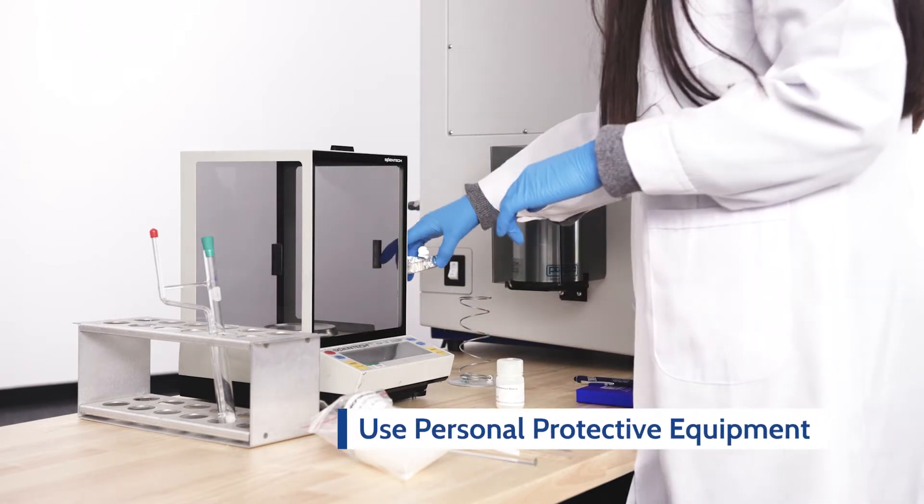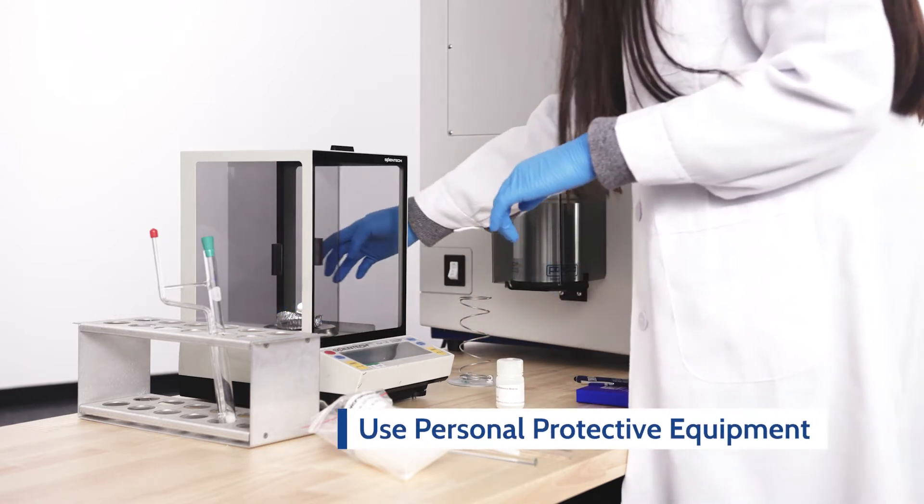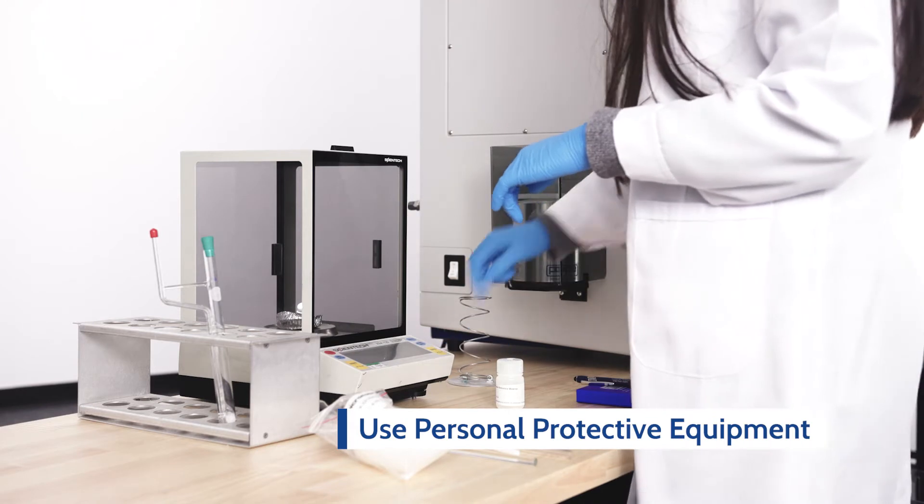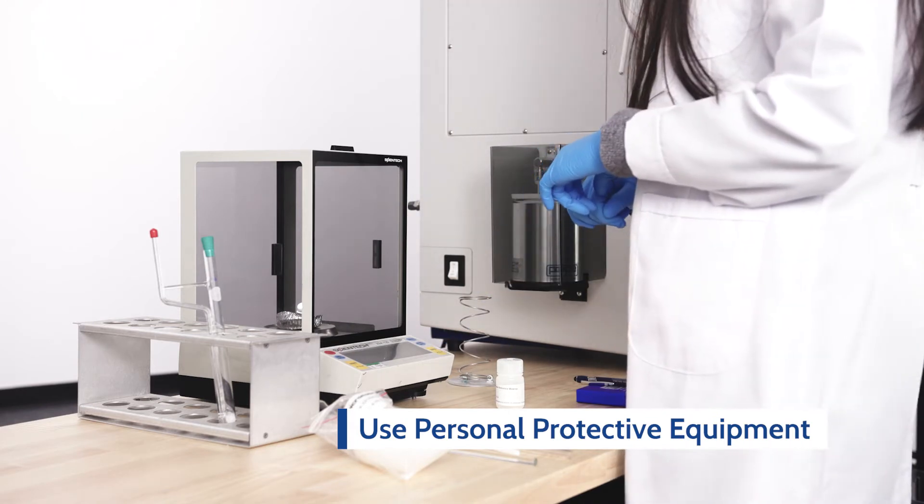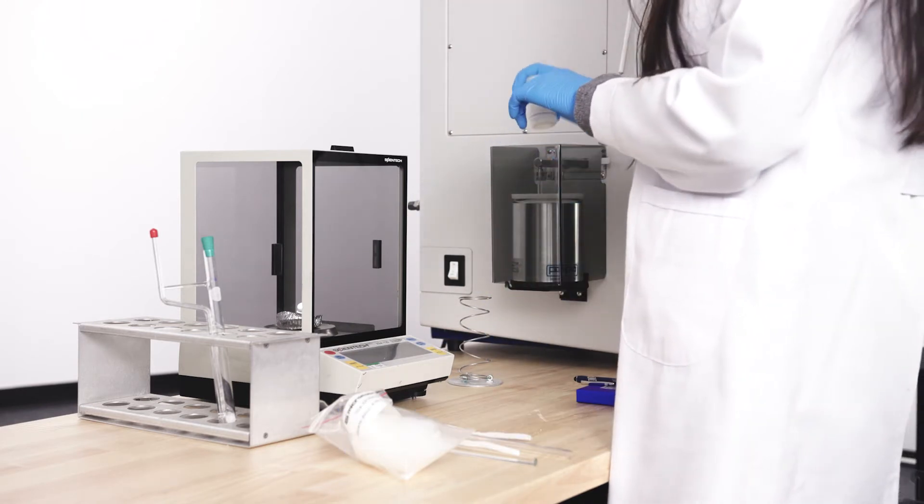Wearing appropriate personal protective equipment, weigh about 20 milligrams plus or minus 5 milligrams of calcium oxalate.